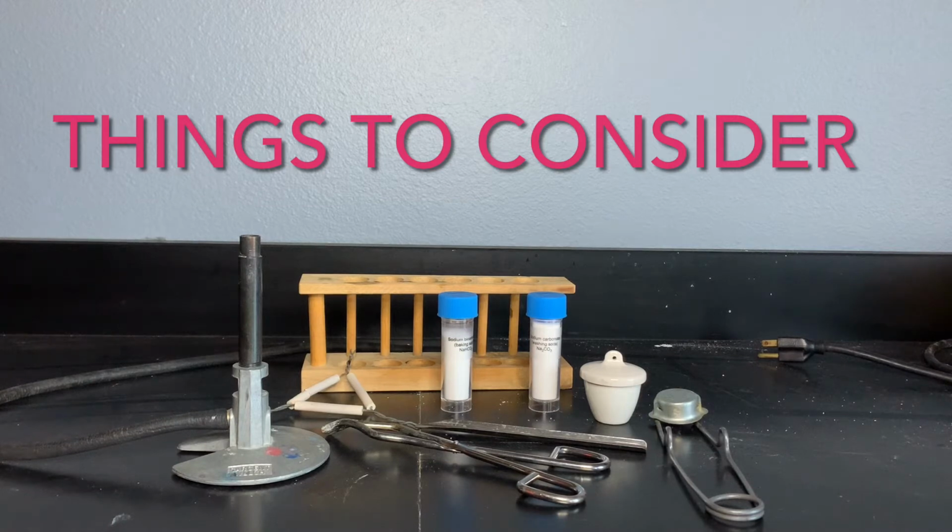How will you reduce error? How will you analyze the data? What type of calculations will you need to make? How will you know that you chose the correct chemical equation for the reaction? And how will your group consider the precision of the balance in your analysis? These are all things to think about.